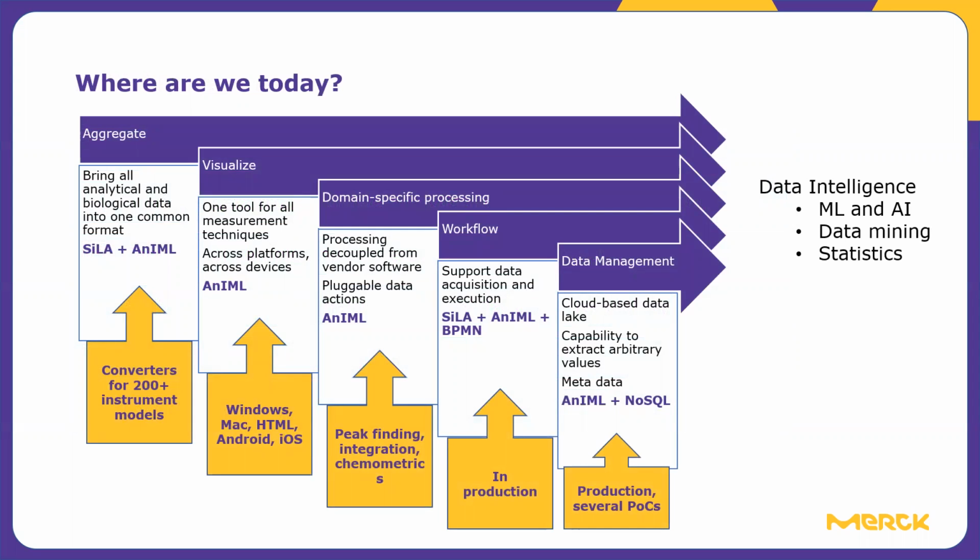So where are we today in terms of tooling and coverage of what can be done in this standardized and interoperable lab of the future? Well, here is a little model that allows us to look at this. So the first order of business is data aggregation.